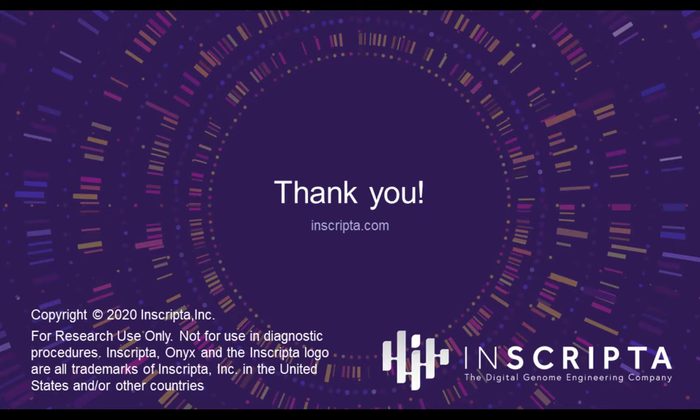Thank you. Do you plan to enable insertions of large DNA molecules, such as heterologous genes and pathways, on the Onyx platform? This is a question that we get a lot, and of course we want to be able to support larger inserts in the future.